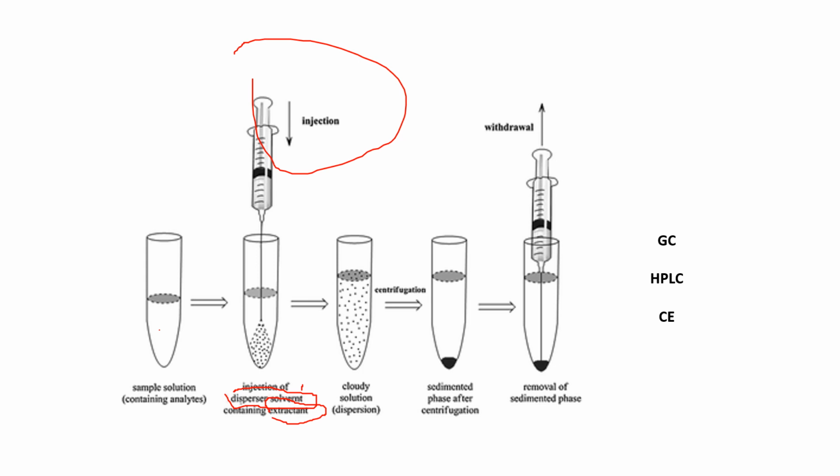Okay, it means when it is mixed with ACN, the ACN will be producing millions of droplets, just like what is shown here. Why are these droplets very important? Because all these droplets will enable the extraction.